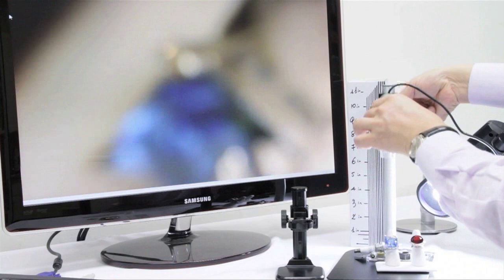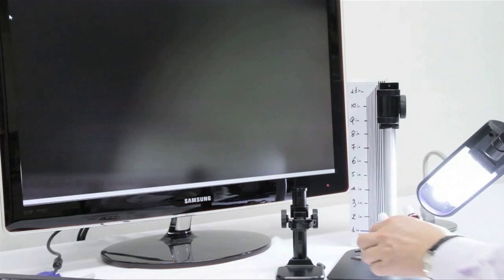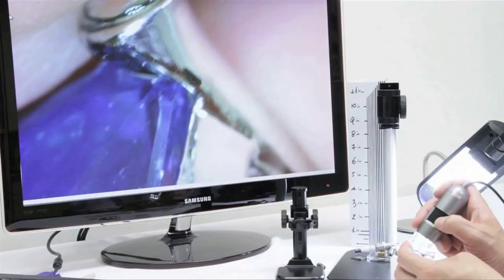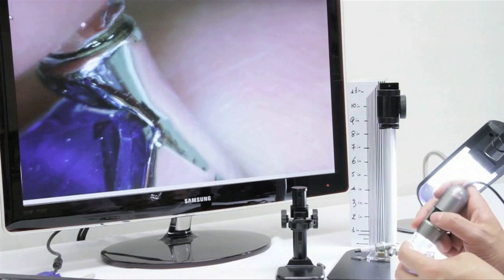This microscope is not confined to a stand. You can take it out and use it handheld. We can also get 50 and 200 times magnification at zero working distance.